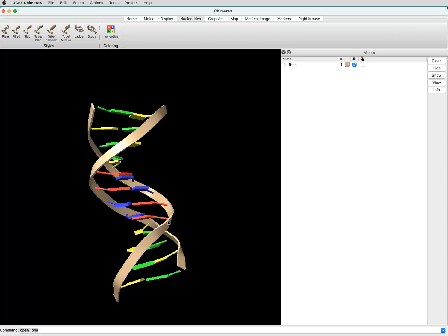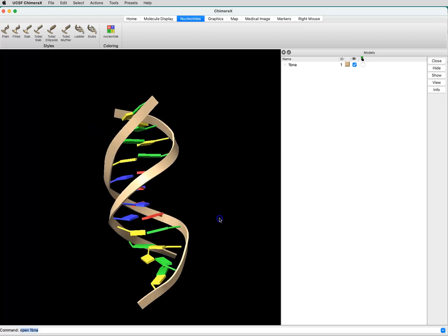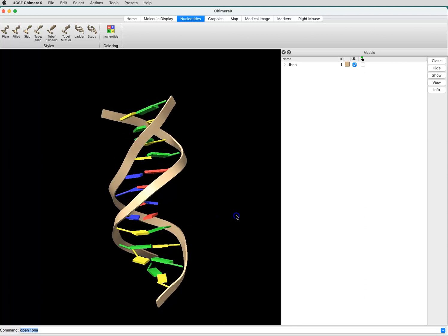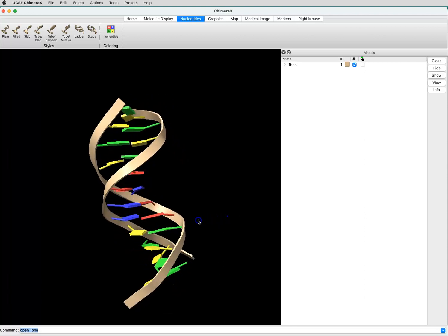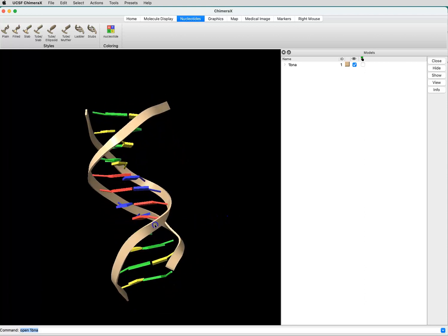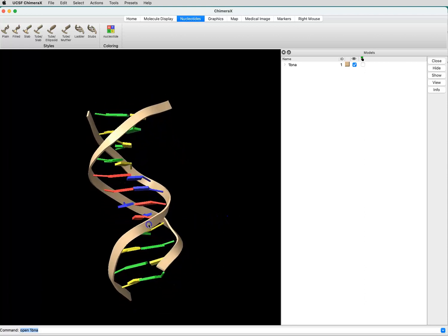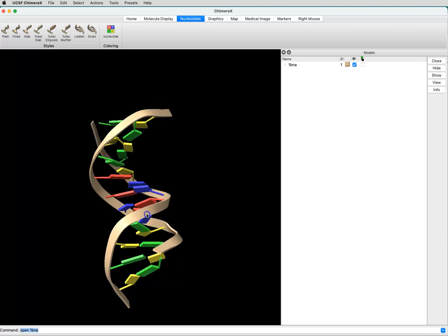When I open up a molecule in Chimera X, it defaults to this ribbon representation, which isn't helpful when we're trying to make measurements and we need to be able to click on actual atoms.